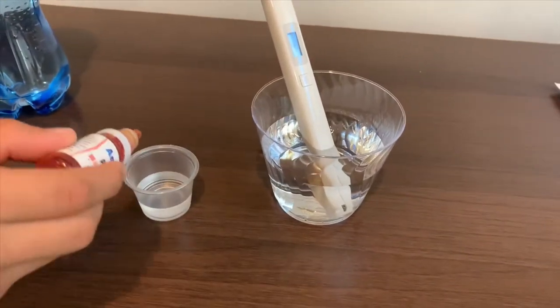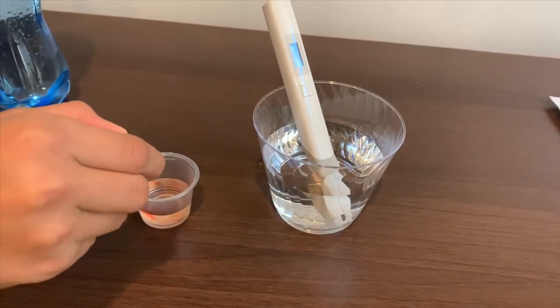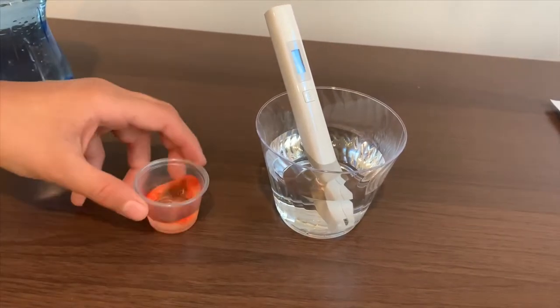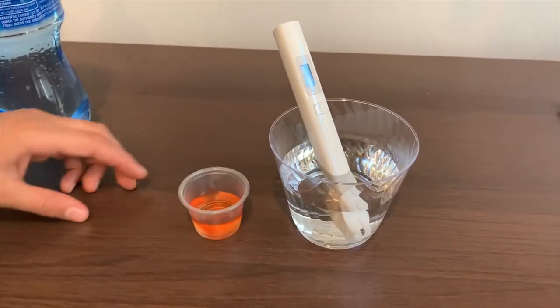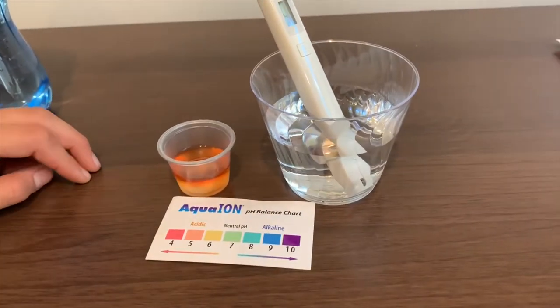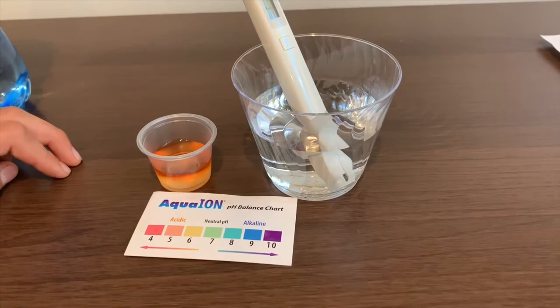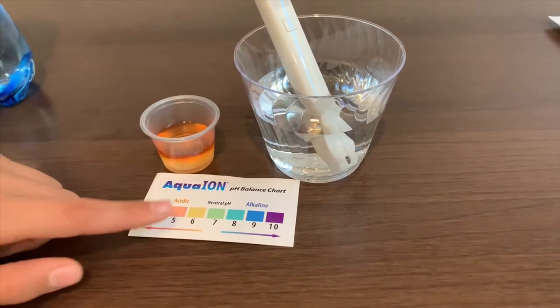Now let's test the pH level. Two drops on it. I'll say that is a five. That is very acidic.